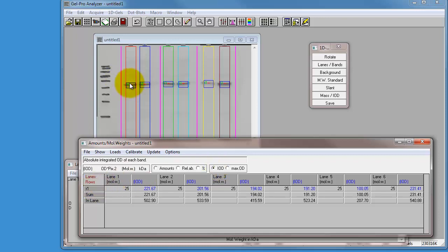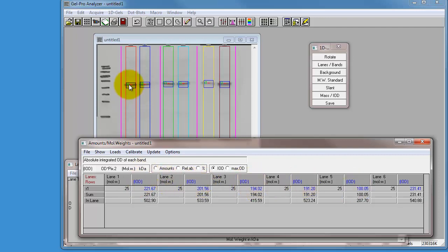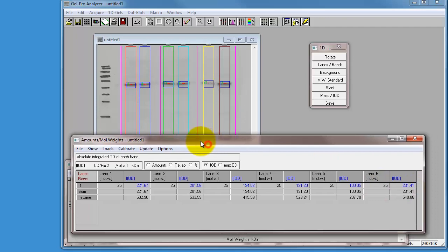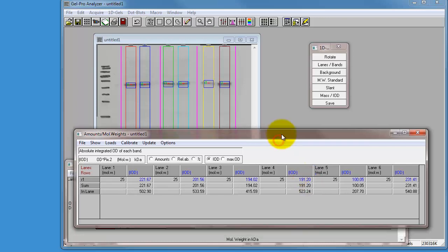What you then see now is R1, R1, R1, R1, R1, and R1. That's the name of our lanes. We've got the integrated optical density here, written in blue, for each of our lanes. And if you look down, you can see that it's saying that it's 221, 201, 194, 191, 100, and 231, respectively, for our bands. And so you can then write these numbers down and give you an idea of the arbitrary unit of density for each one.